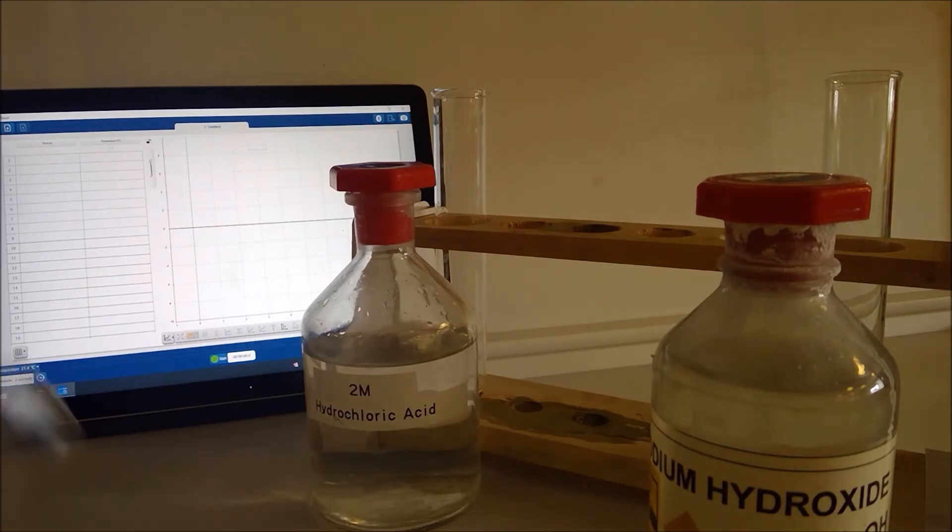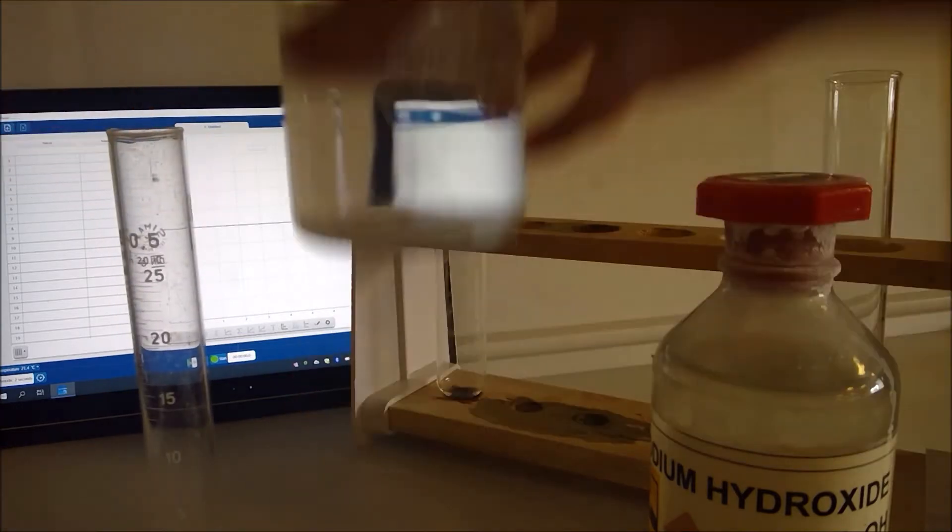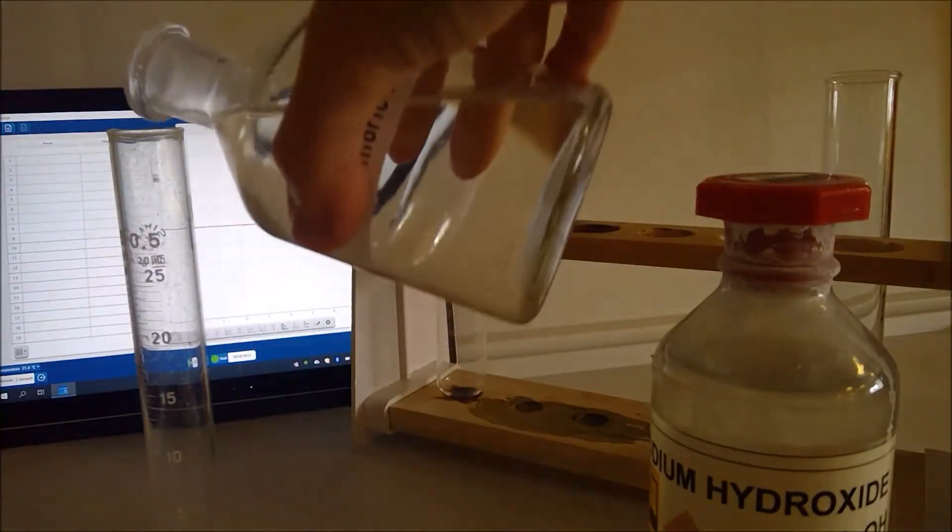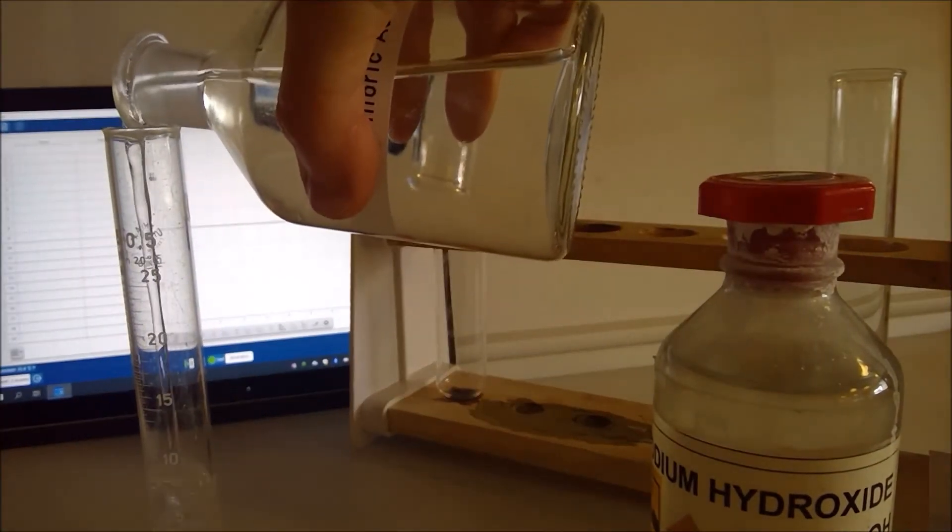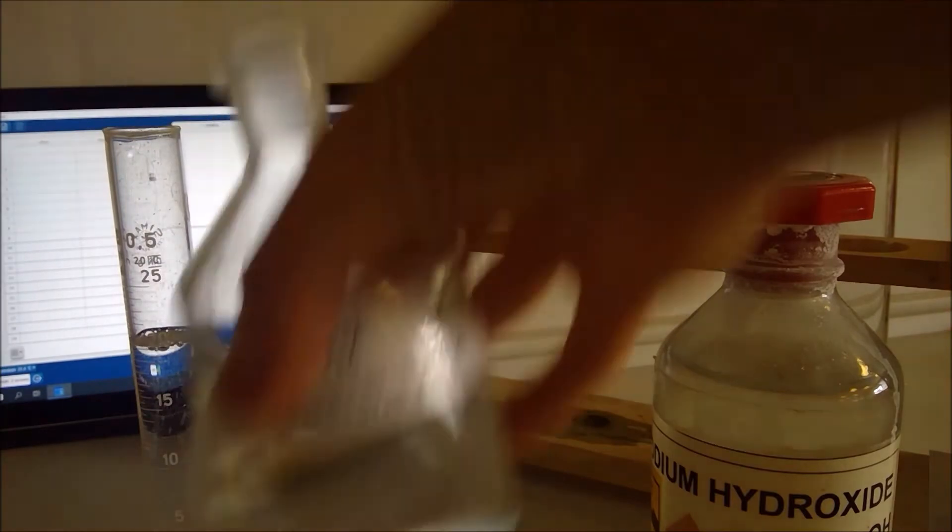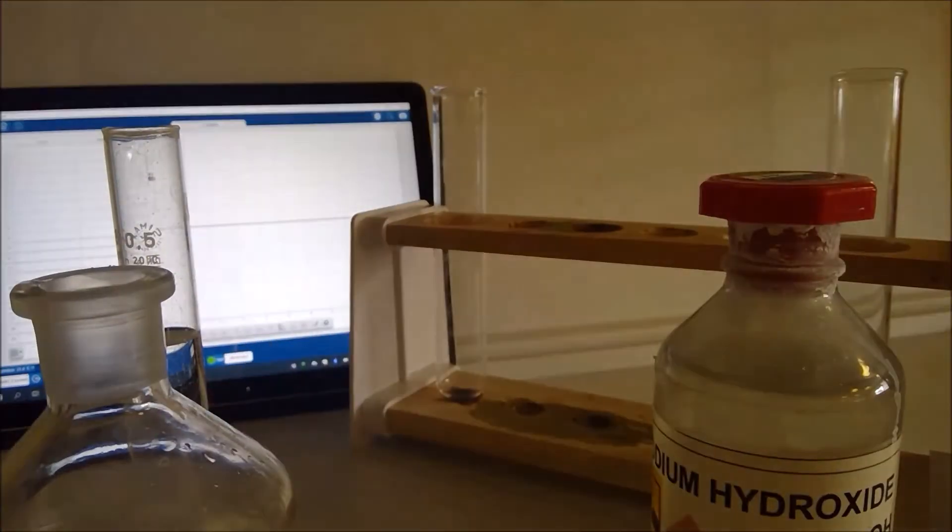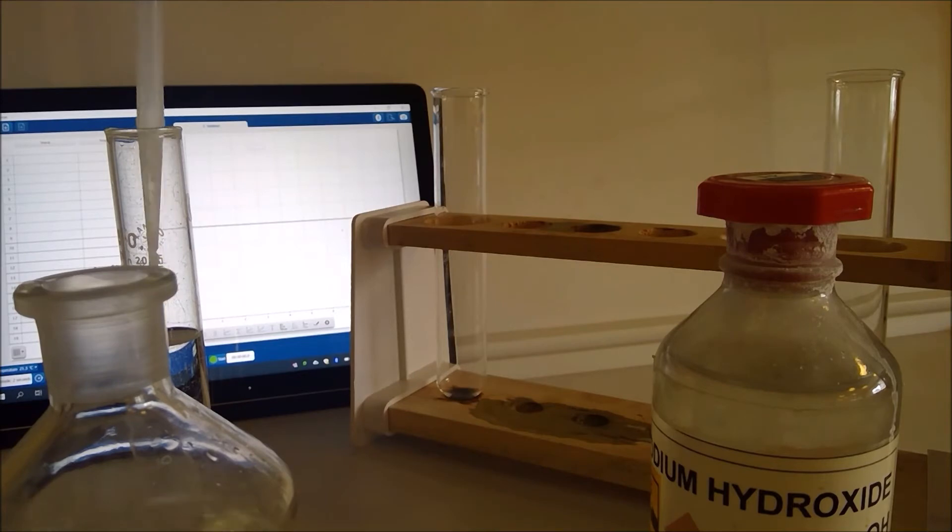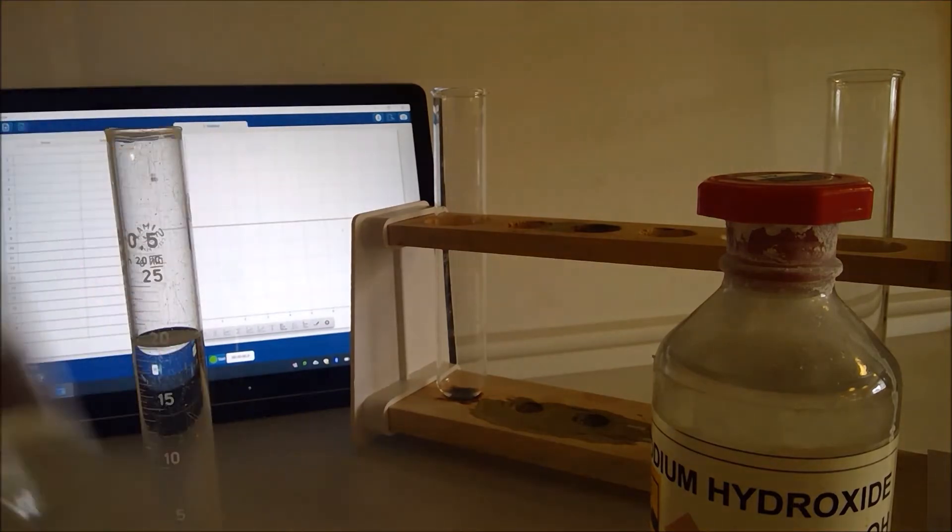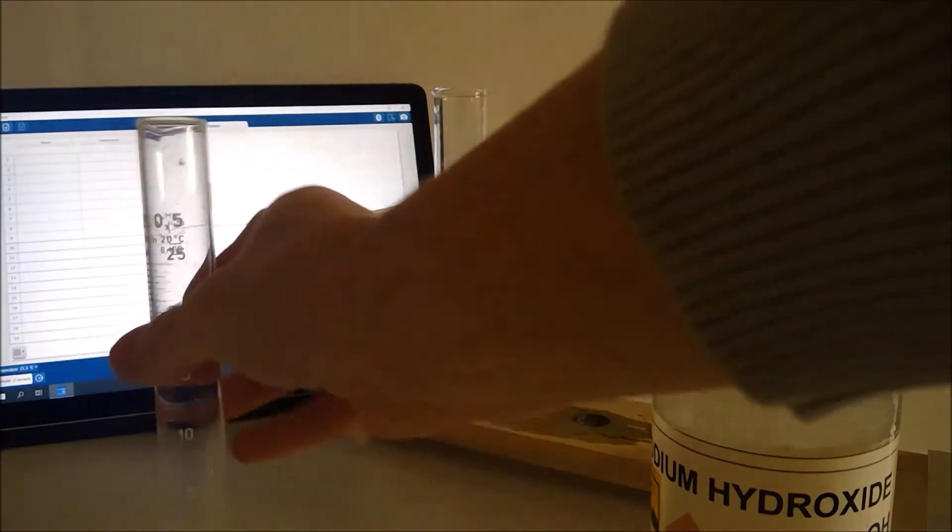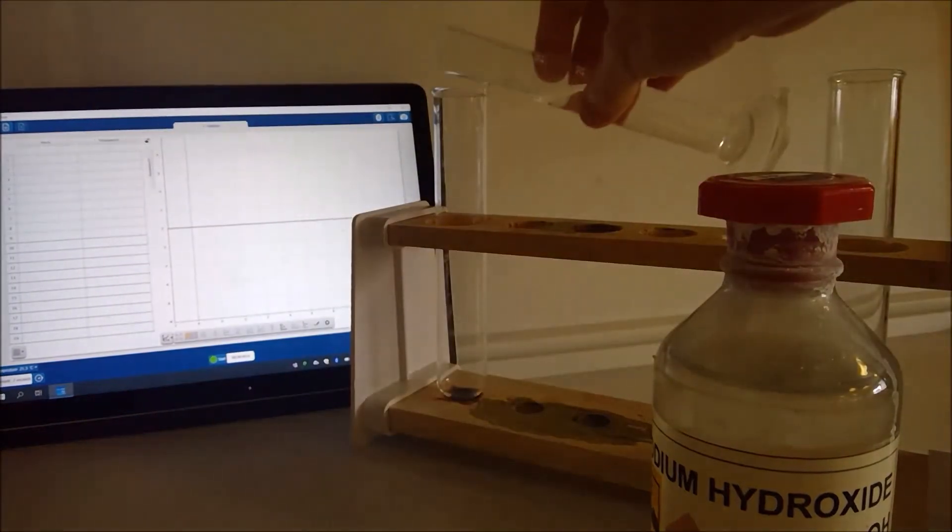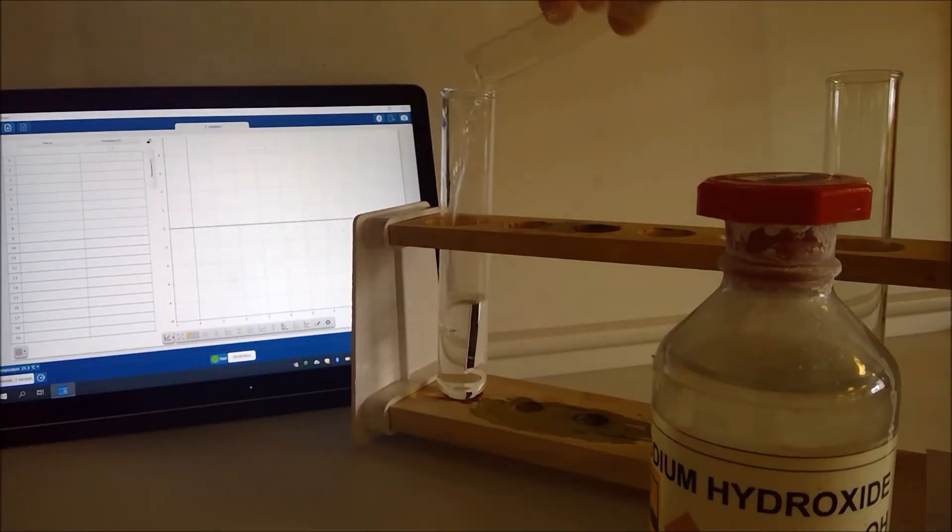So I need to measure out first of all 20 centimeters cubed of hydrochloric acid. I'm just going to use my dropper pipette to make sure we've got exactly the right amount there and I'm going to pour that into the first of my boiling tubes here.